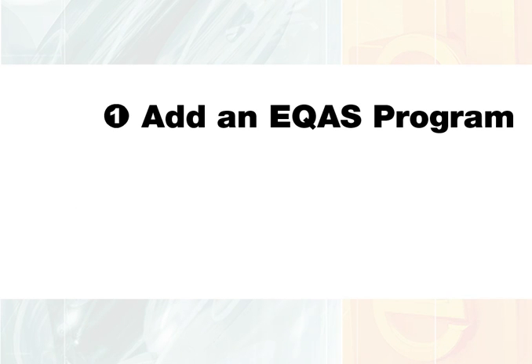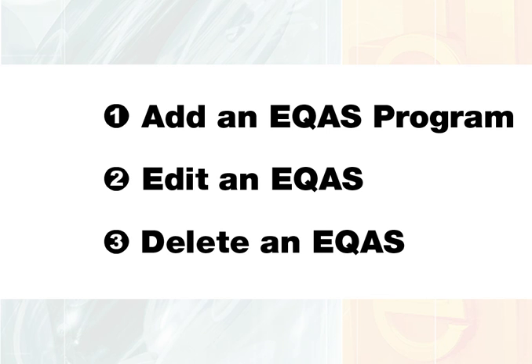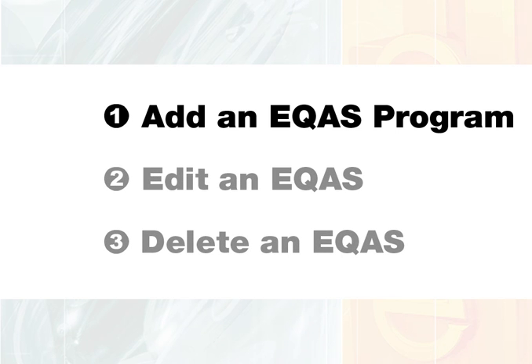You can add more programs to your lab ID using eQAS Online. You can also edit program details or delete specific programs using eQAS Online. If you are currently participating in a Bio-Rad eQAS program and you do not see this program in the Program Setup page, please contact your local Bio-Rad representative.